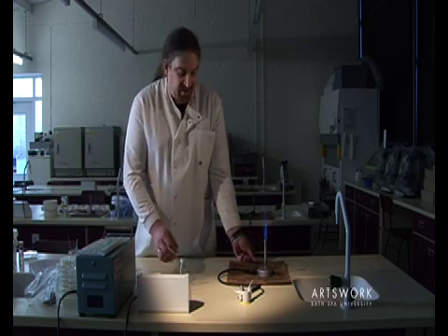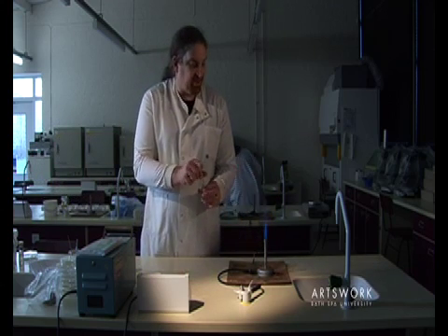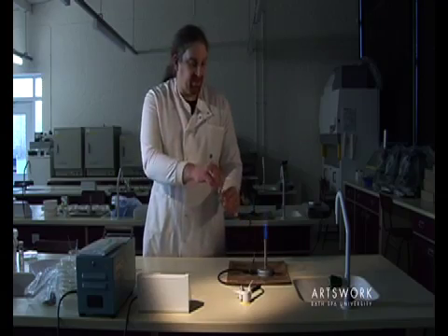The same applies if you're using the flame to sterilise bottles. Once you've opened the bottle, pass it through the hottest part of the flame to sterilise it.